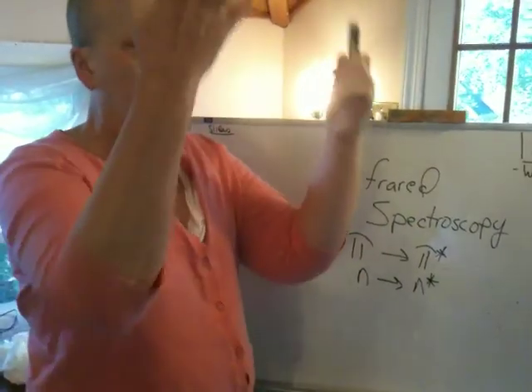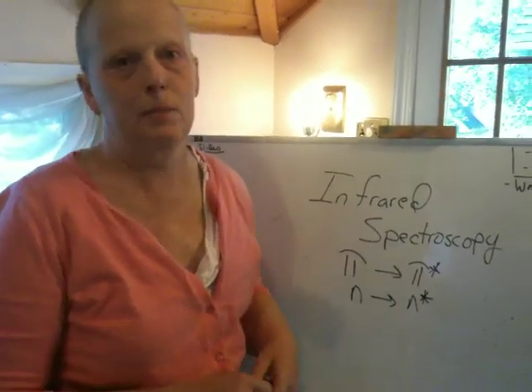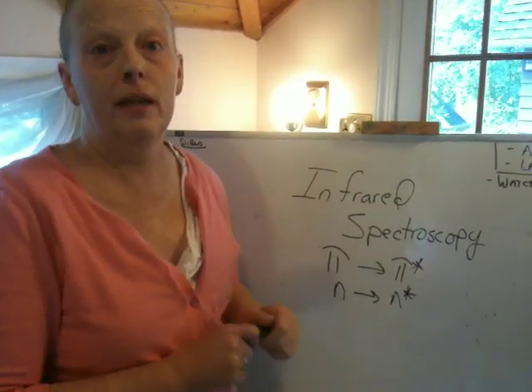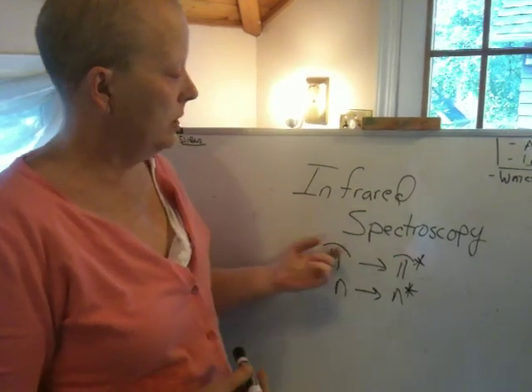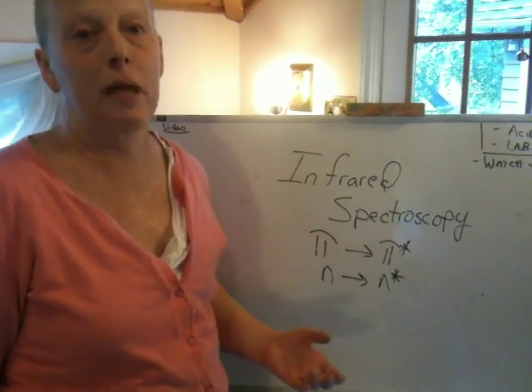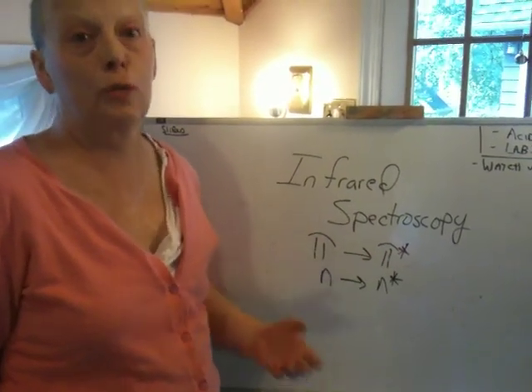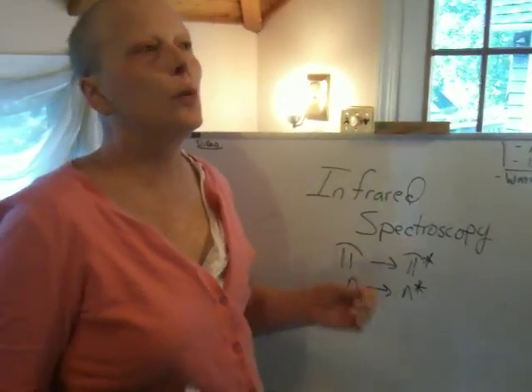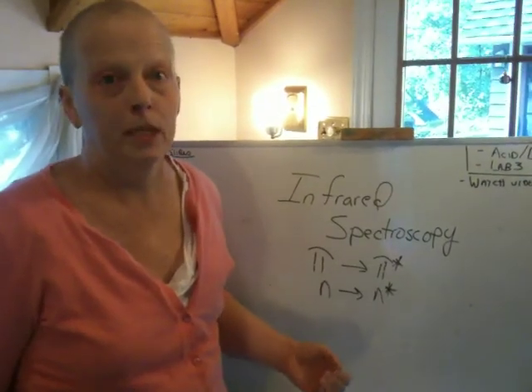And you pump an electron up, and then the electron relaxes back down. But when that happens, energy is absorbed, okay? And that normally occurs, like a pi to pi star transition in a given molecule, at a discrete wavelength.